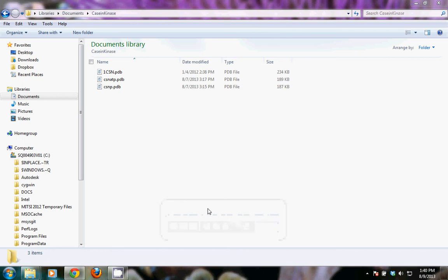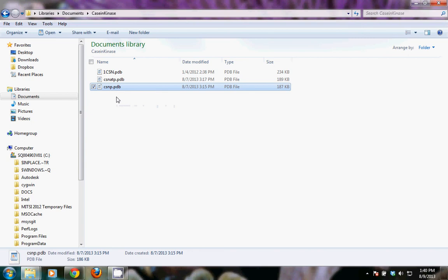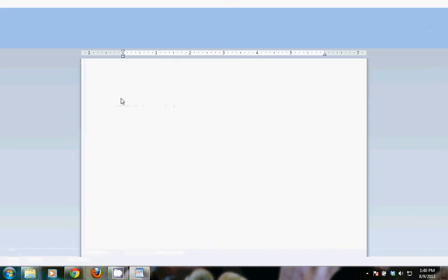Okay, let's take a look at the PDB files that we just created. The first one was CSNP for protein only. So I'm going to open that with WordPad.